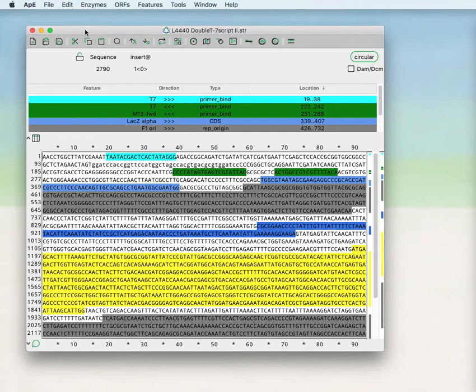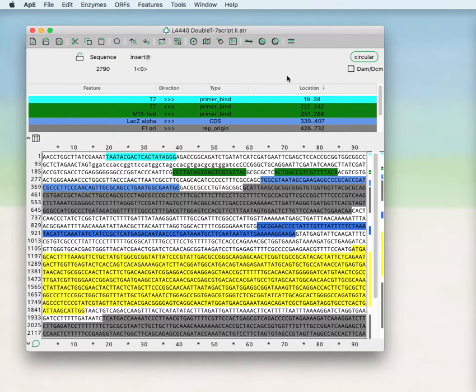You see that sequence windows both on the Mac and the PC have a toolbar at the top, an information box showing the current sequence that's selected, and a feature table.